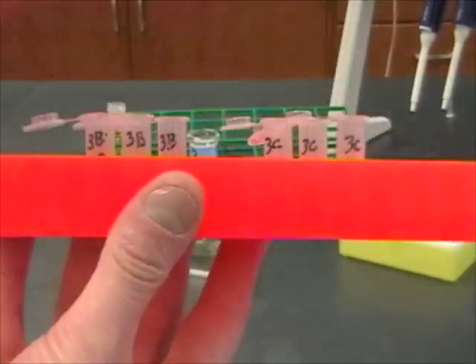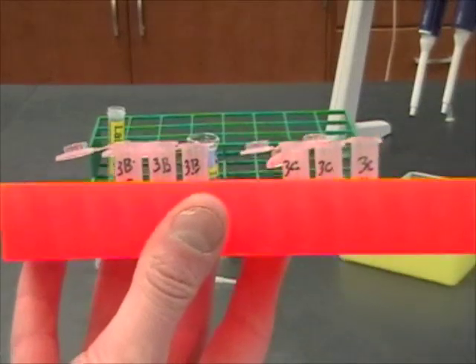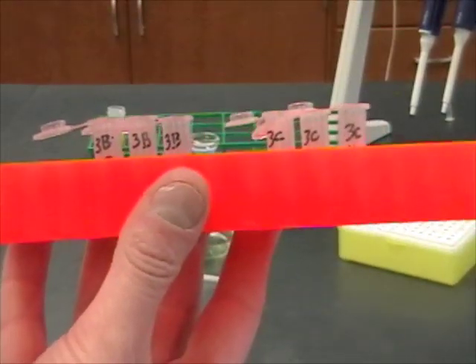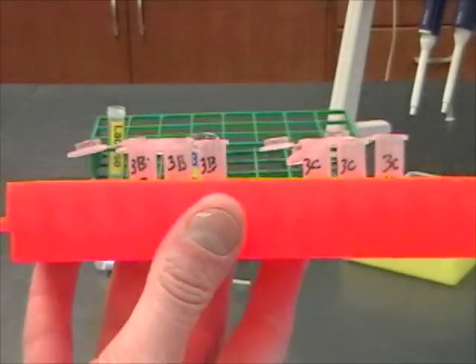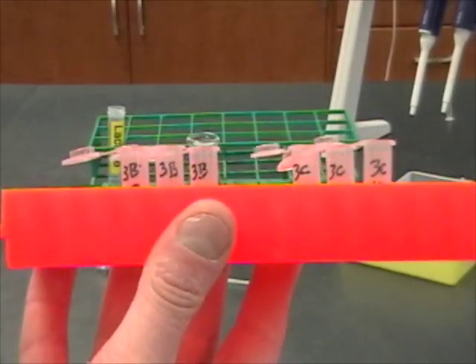There are just six tubes here, but these are only the tubes that I need. Everybody in the lab is going to need six tubes labeled 1B, 2B, et cetera. So there's going to be a lot of tubes in here, and you've got to get them all measured out before you start.